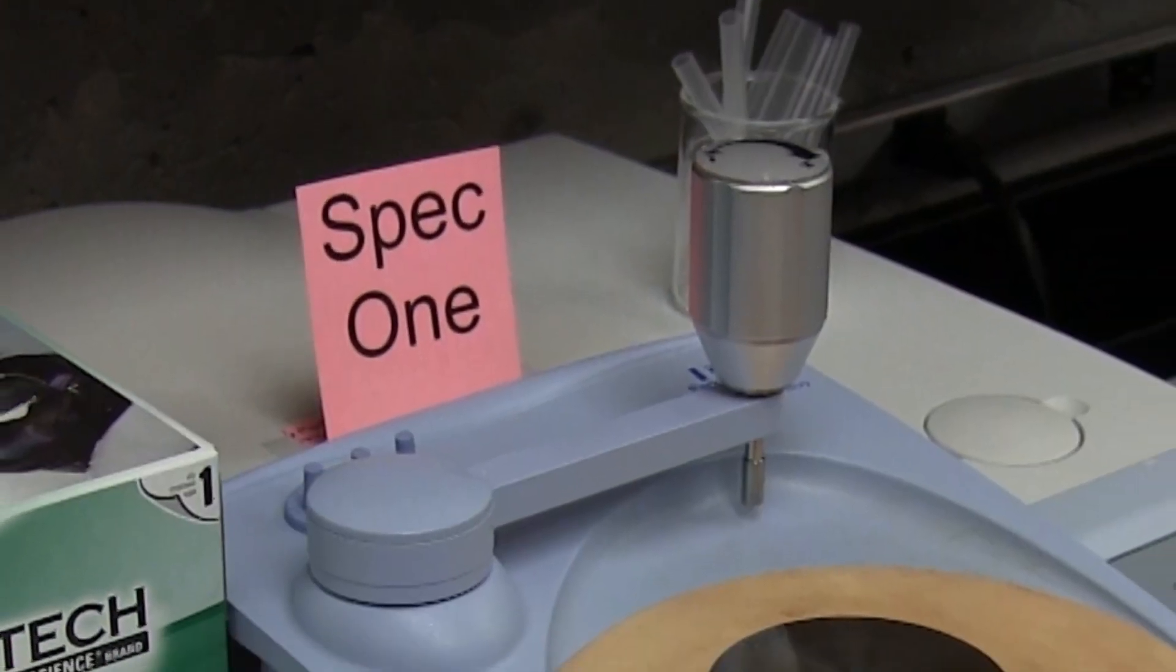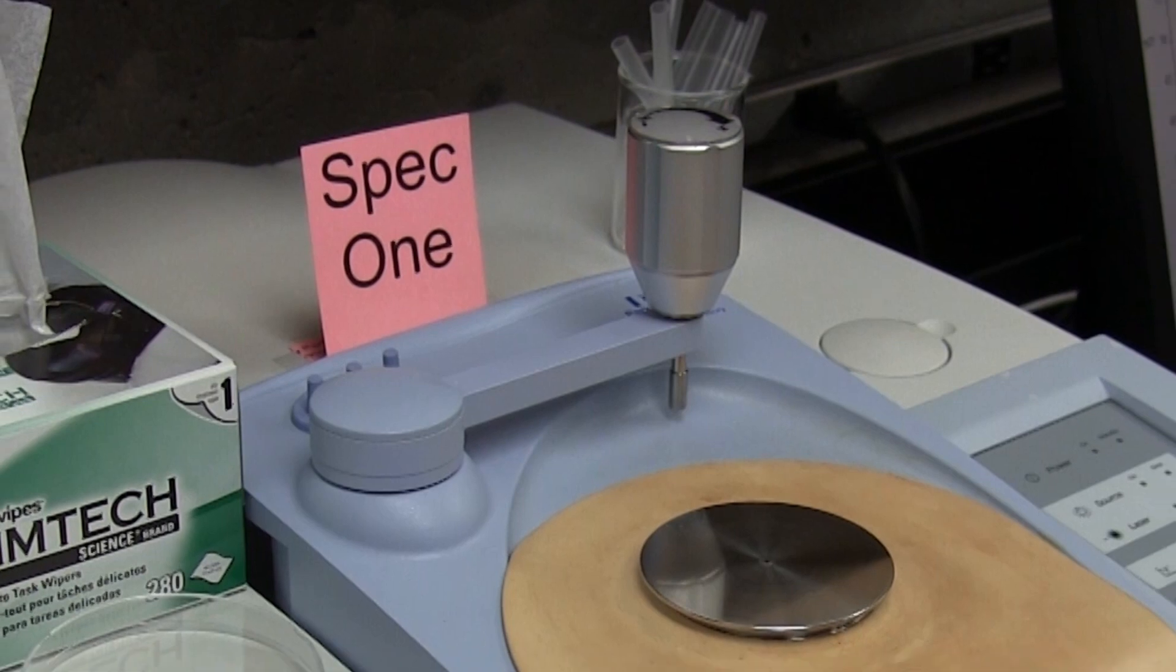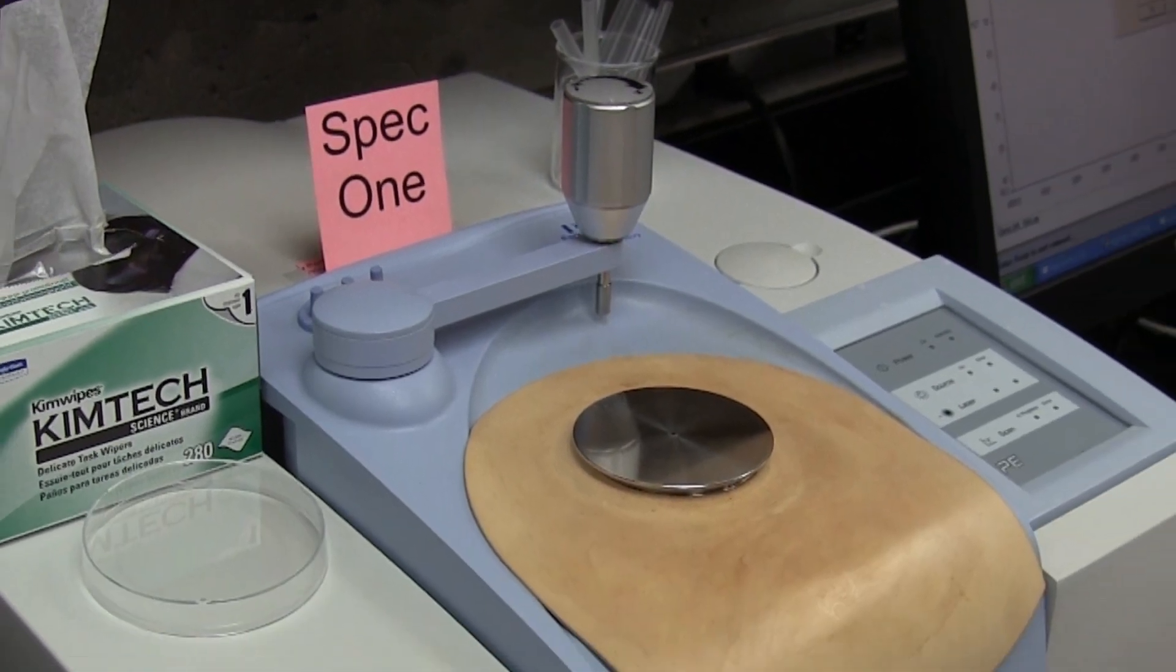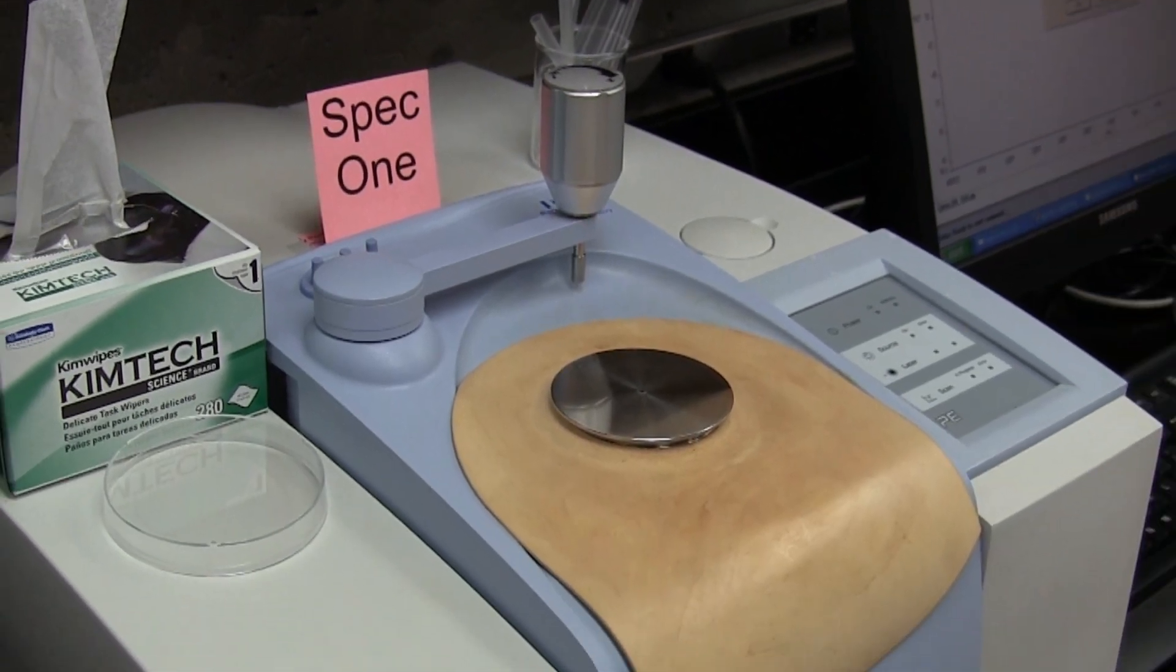SPEC 1 is equipped with an ATR module. ATR meaning attenuated total reflectance. The ATR is used to obtain spectra of liquid and solid samples, and you can refer to your lab manual for more information on the ATR.